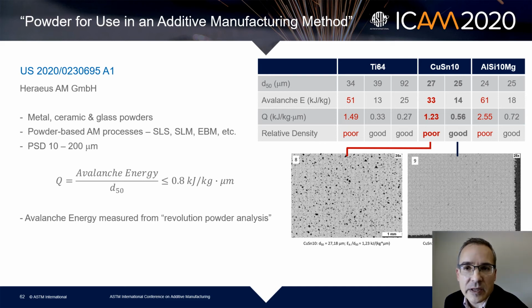So this is really interesting. It's the first time I've seen any patent built around this avalanche type rheometer data. So it'll be interesting to see where this goes.